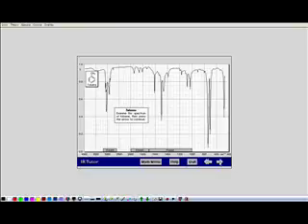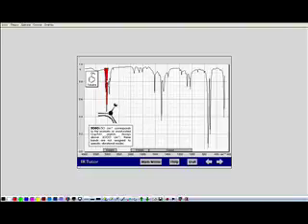Benzene ring. Well, when you have a benzene ring, because a benzene ring is made up of carbon-carbon double bonds, the CH stretch is just about 3,000. And so you really can't tell the difference between a benzene ring and a carbon-carbon double bond. But at least you can tell that the molecule has a double bond or has a benzene ring from infrared. And so we see that. Sometimes we see these three little guys right here. Those are overtones from some other stretches, but they tend to show up when we have a benzene ring.